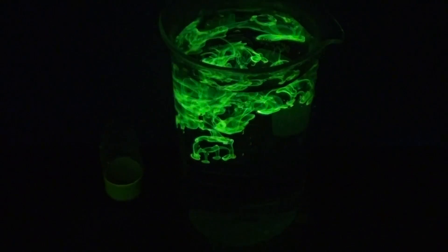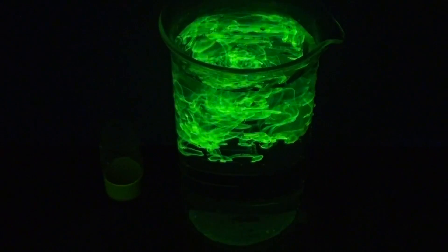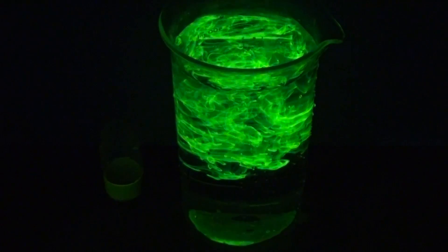You might be asking why the concentrated solution doesn't also glow under ultraviolet light. That's because it's so concentrated that it absorbs and quenches its own fluorescence. A dilute solution doesn't do that.